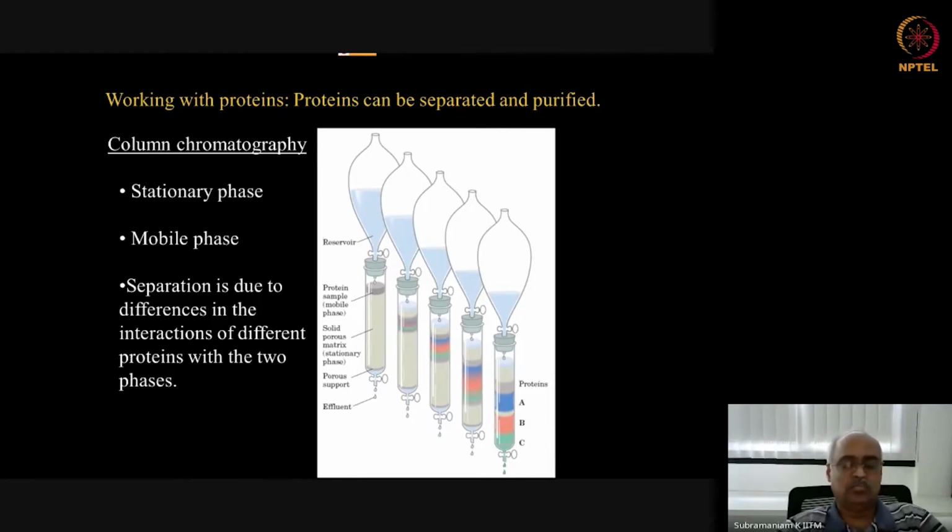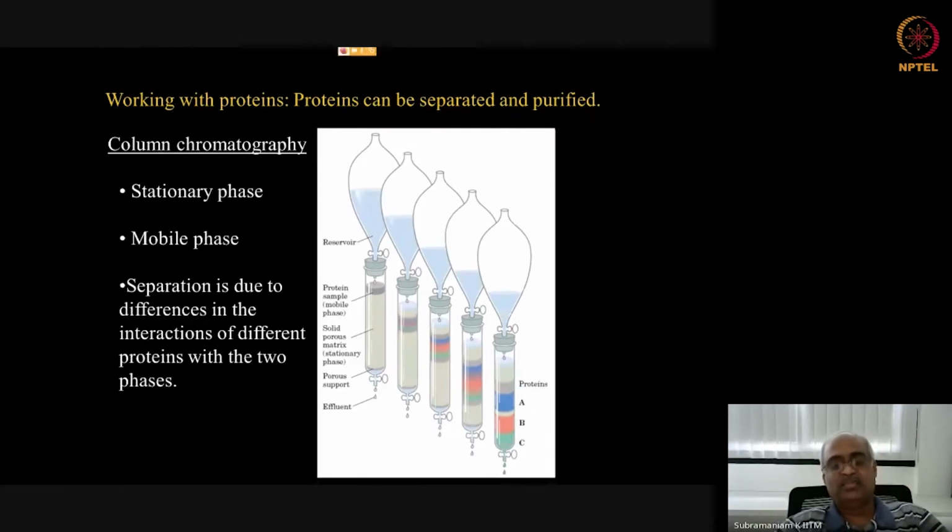Let us say that is solute A. So solute A would have now gone more into butanol than in water. And if you have solute B that prefers water more than butanol, then after one round of this mixing and phase separation, you will find the ratio of A to B having changed in the water. And if you repeat it multiple times, eventually what you will find is A would have mostly gone into butanol and B will be mostly in water. So the A to B ratio in water would have drastically decreased. This is what we call counter current distribution.